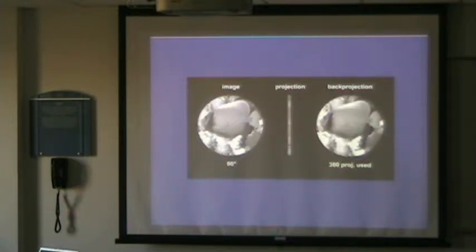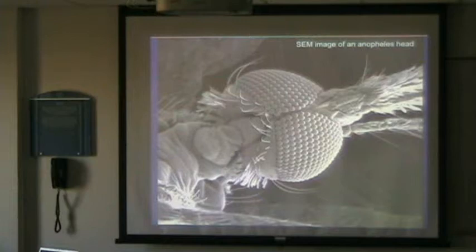And we have our fish back. So, having said that, why do we get this 3D looking image in an SEM? Anybody an idea? This is not made by a lens. This is not a lens-based image mode.